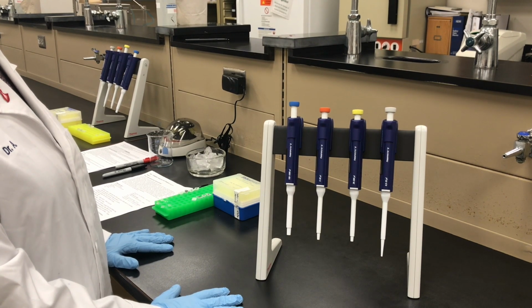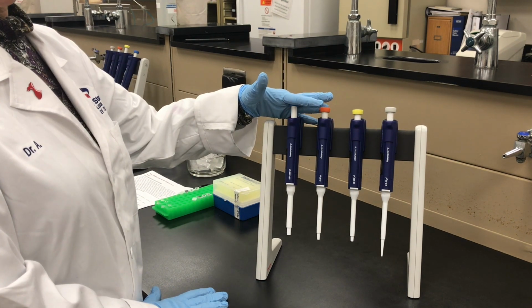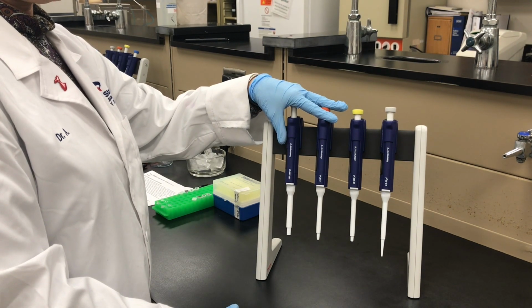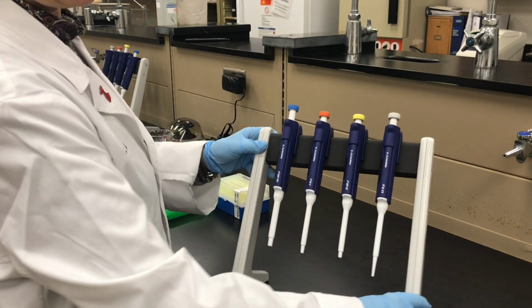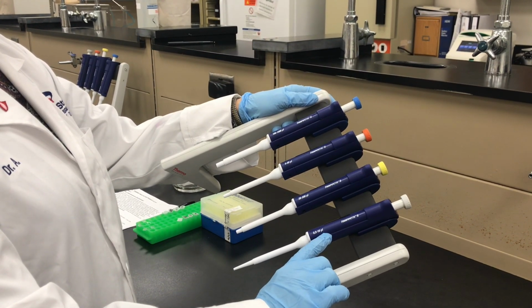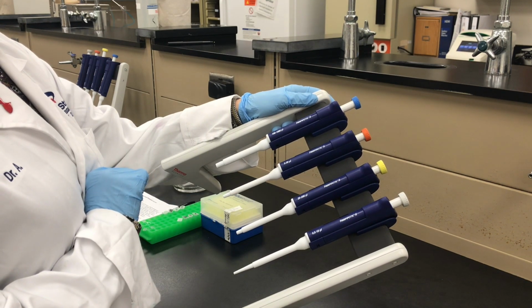So this section is going to take you through setting up the PCR experiment. The tools we're going to be using are micropipettes, and they are very precise. Not like the pipette you were using for that plate count experiment. So these come in a set of 4. The ranges, I'll turn it this way. How are we doing? 0.5 to 10 microliters. A microliter, there's 1,000 of them in a mil. 20 to 200 microliters. 5 to 50 microliters.